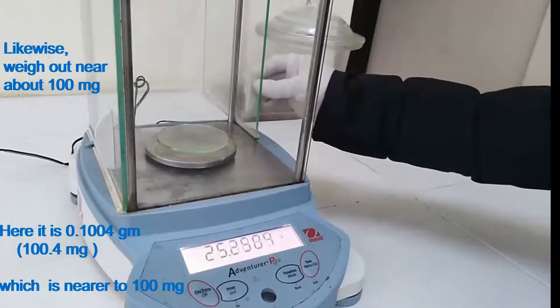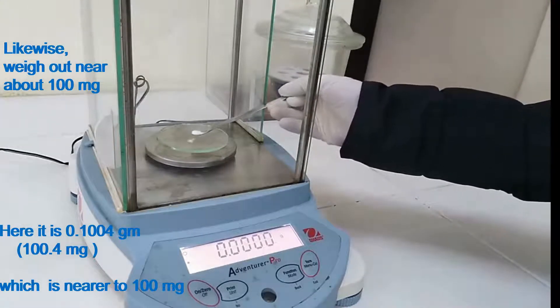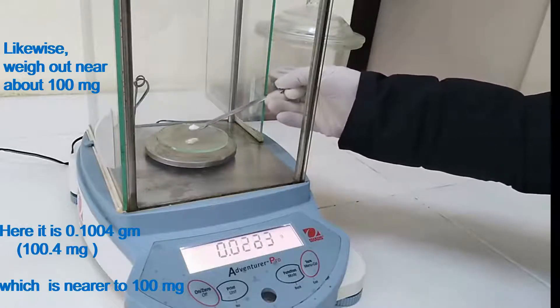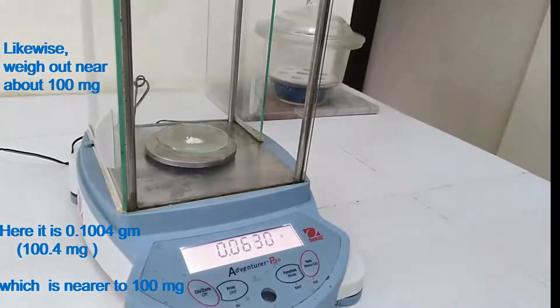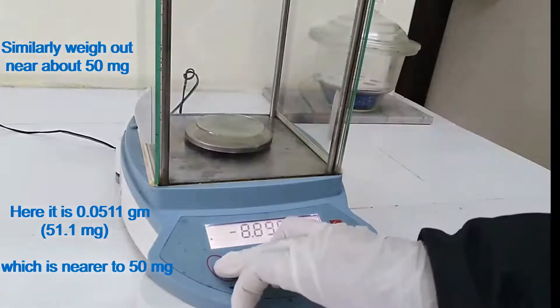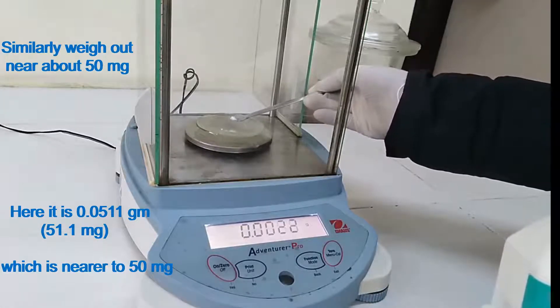Likewise, weigh out near about 100 mg — here it is 0.1004 g, i.e. 100.4 mg, which is nearer to 100 mg. Similarly, weigh out near about 50 mg — here it is 0.0511 g, that is 51.1 mg, which is nearer to 50 mg.